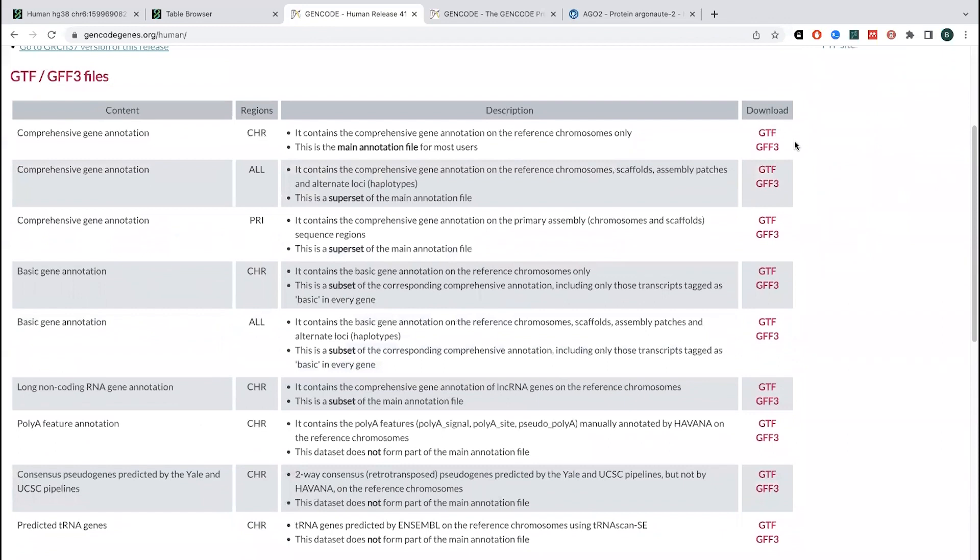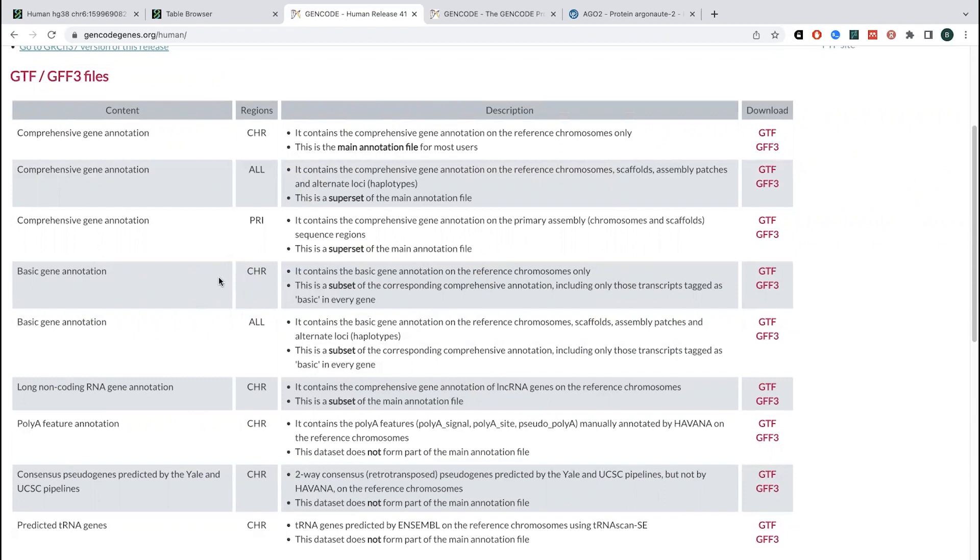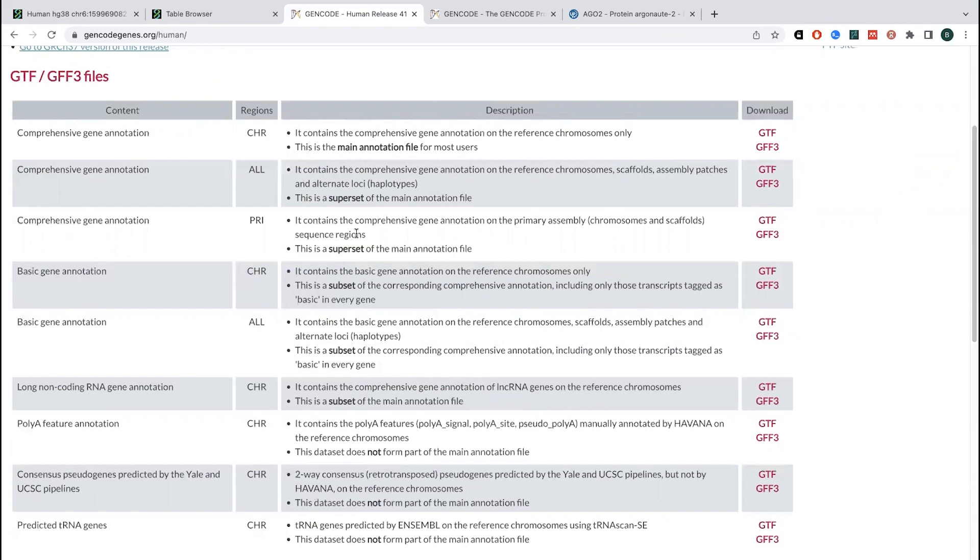And then the annotation files are typically coming in these forms like GTF, GFF3, potentially a bed file. These are going to have the annotation data and you can see that you can choose different annotation data depending on what you want. So comprehension, comprehensive, this is going to be - it'll have a lot of different, it'll have a lot more than just the canonical stuff. If you just want the canonical stuff, then there's this basic gene annotation.